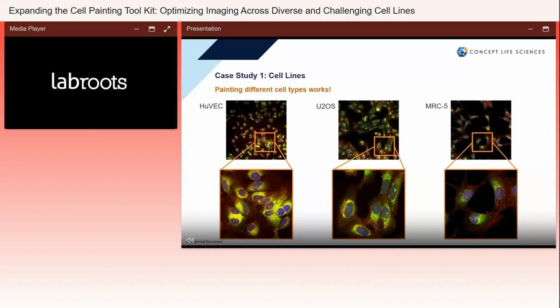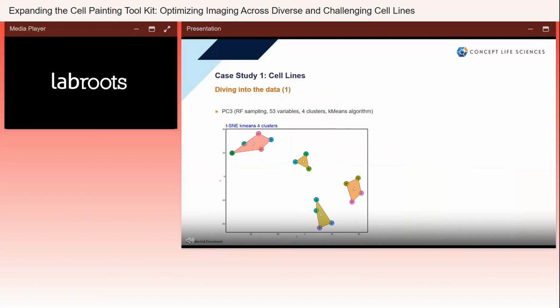Anyone who's used them before will know that they're particularly difficult to work with and put down large amounts of debris during their growth. As such, the images can appear dirty due to fragments causing autofluorescence. Even with this, however, you can still pick up the cellular structures and organelles. So we're able to generate images, but can we actually determine anything from them?